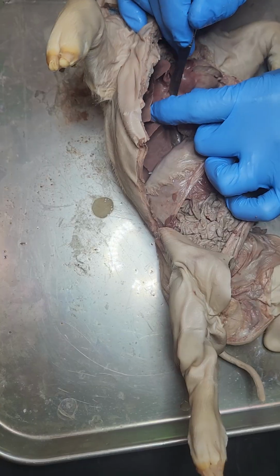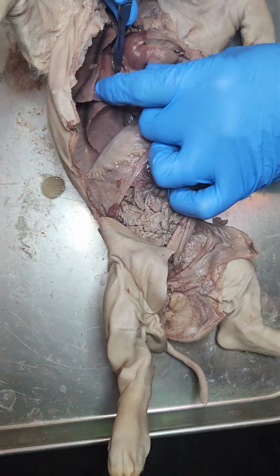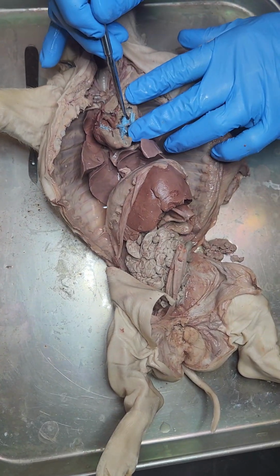All right, can you see that right there? See that vein coming in? Yeah. Okay, so that's pulmonary vein. Left atrium, and let's see, left atrium, left ventricle. So left atrium up top, left ventricle at the bottom.